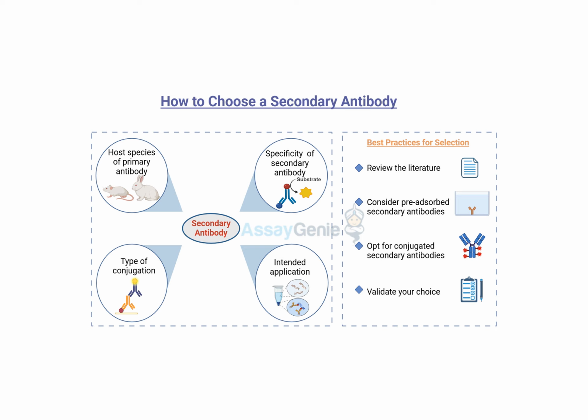So the physical properties of the antibody come into play. Okay, and what about IHC and IF? Well, with IHC and IF, you're working with tissues, which are much more complex than, say, just cells growing in a dish. Things like the type of tissue and the way it was prepared can all impact how accessible your target molecule is. Some antibodies might be better at getting into certain types of tissues, or they might work better with certain preparation methods. It just depends.